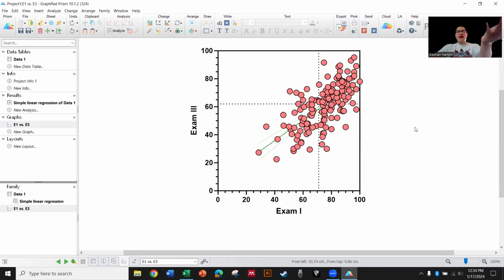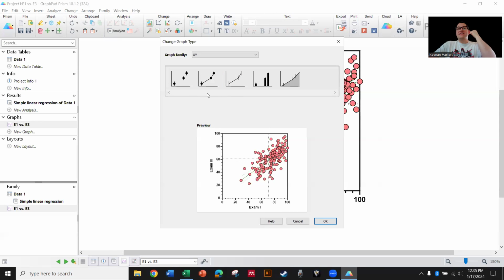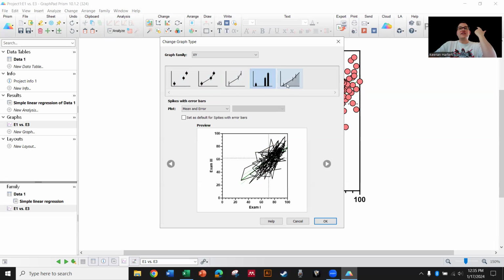typically just takes you back to where you started. It's a good program to mess with things and decide what looks good and what doesn't. So that'd be my suggestion for some of these. If you're in the middle of doing your stuff, here's some other good stuff in here. If you want to choose a different type of graph and you're in the middle, you can go back to this stage right here. You'll start pushing things in here again. It'll start asking about this.